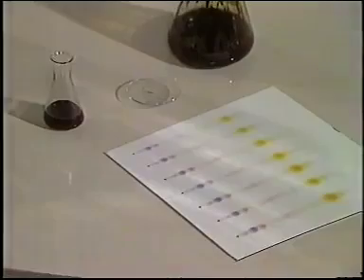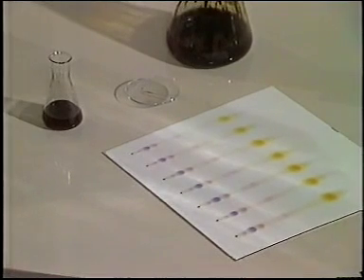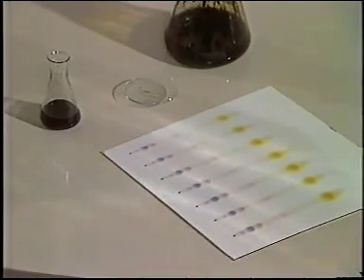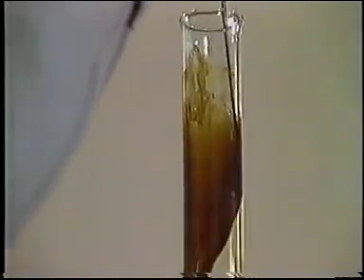TLC is a very good analytical technique. It tells us what's there, and in some cases, a quantitative estimate can be made. But there's one important snag. TLC uses at most a few milligrams of material. What if we need to separate compounds on a larger scale than this? For this, we need column chromatography.